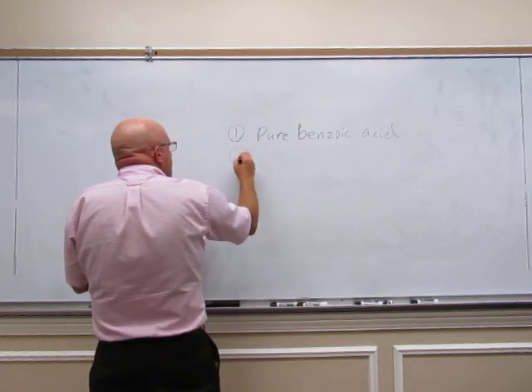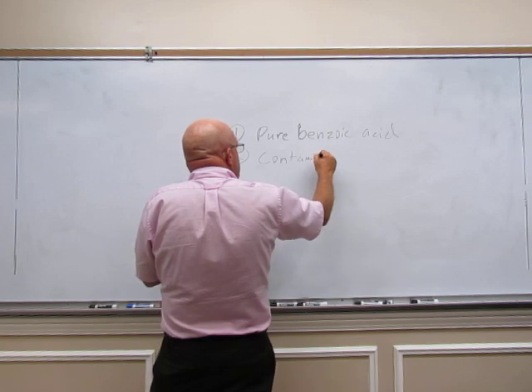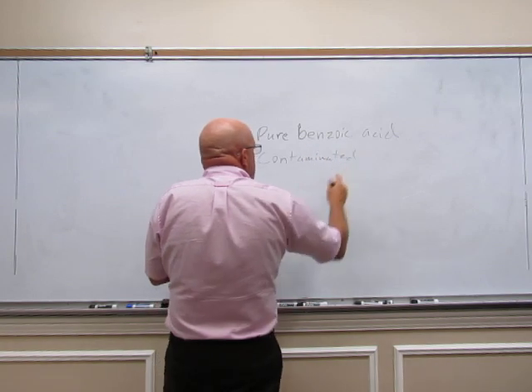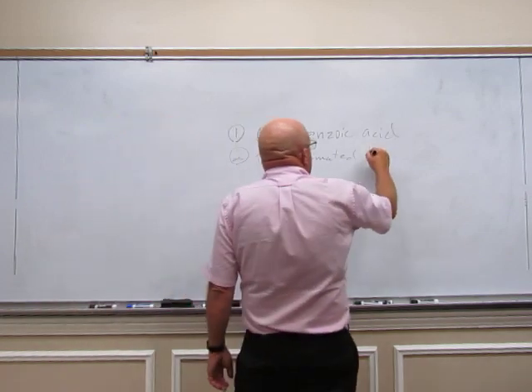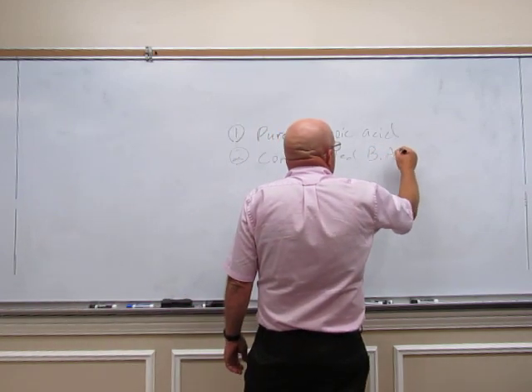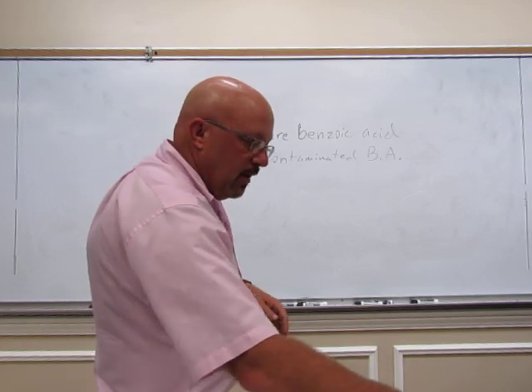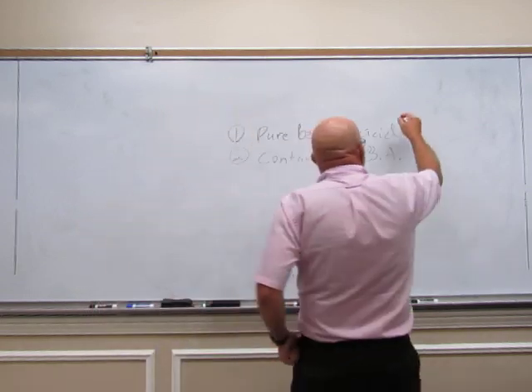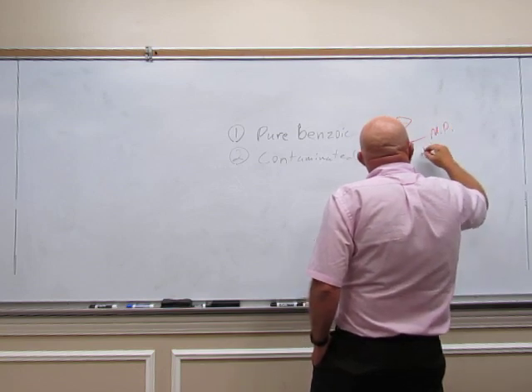I want you to take a melting point of the contaminated benzoic acid. We'll just put BA for benzoic acid. So these I want you to do this week. Do melting point this week.